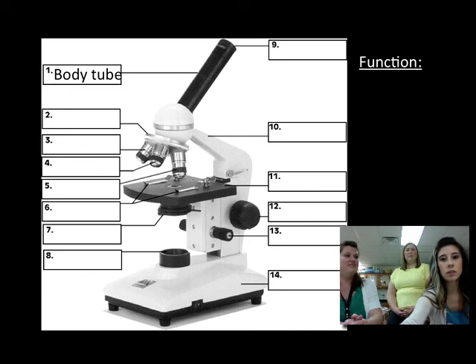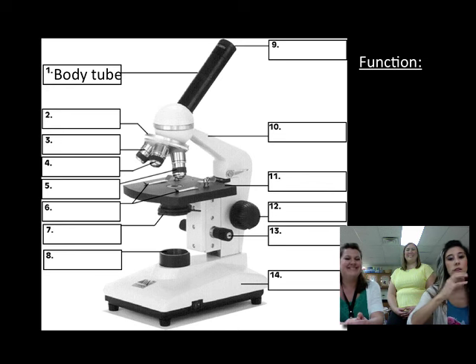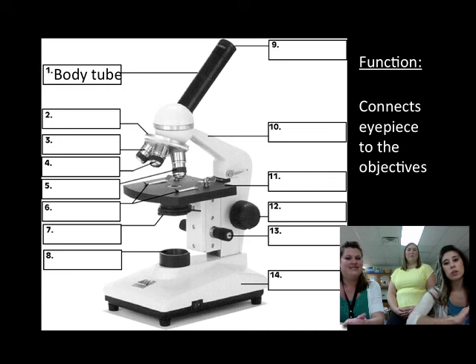Now we're going to go through the functions and parts of the microscope. First we have the body tube, that's number one. This portion connects the eyepiece to the objectives.